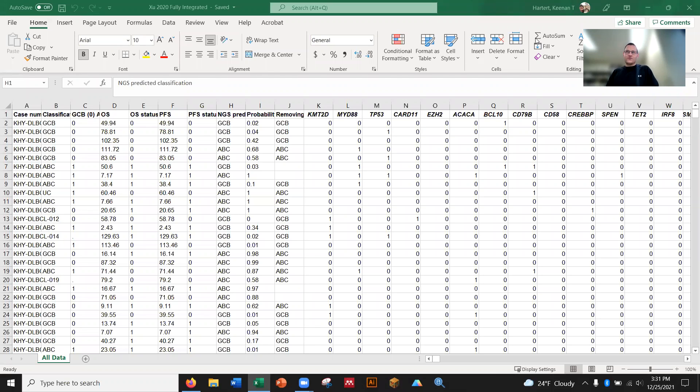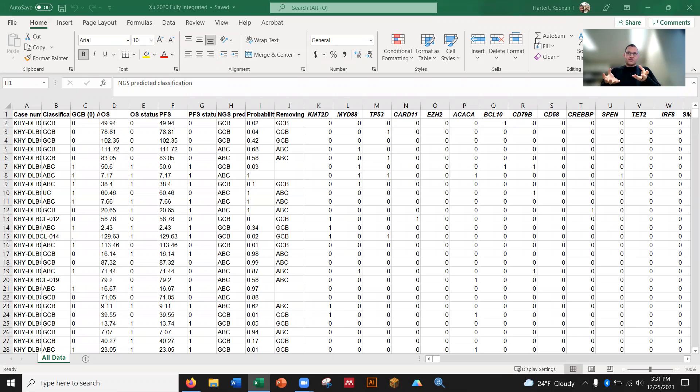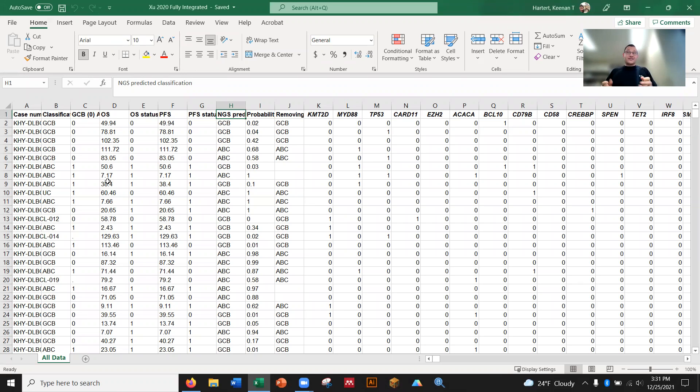Alright, hi everybody. This is sort of a catch-all video where I'm going to show you a couple basics of how to use data and one of the main tools that I use to take massive swaths of data and make sense of them. So beginning, first section of the video is basically just some Excel tricks.